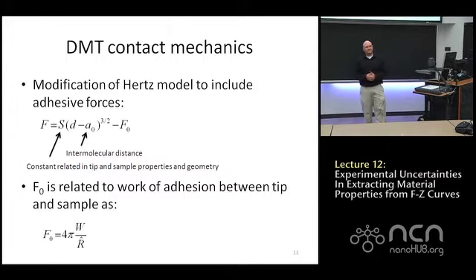Just to close my idea: with the DMT model, at the end, I am fitting a curve. Yeah, at the end of the day, we're going to fit a curve, any fitting to the F-Z curve.